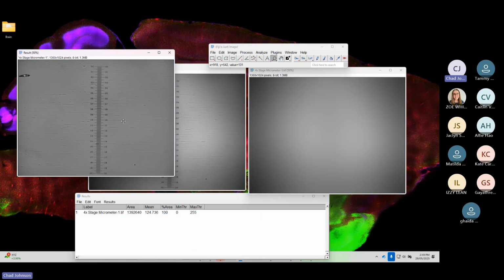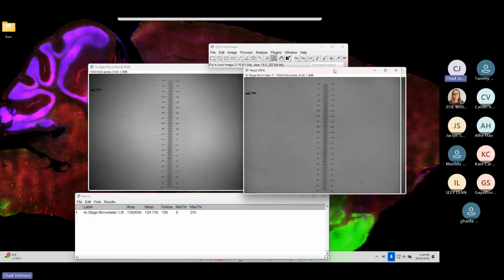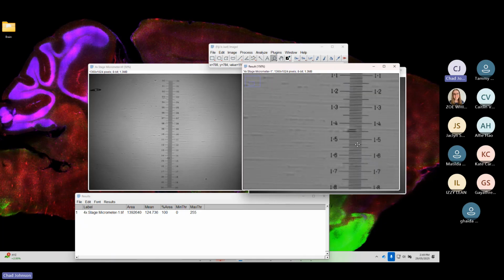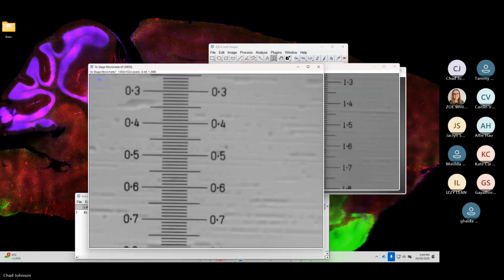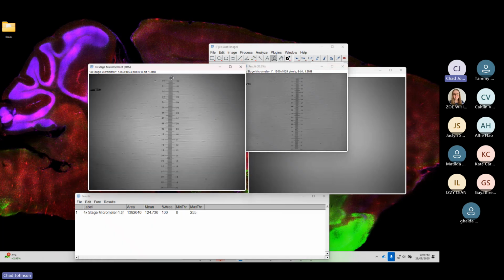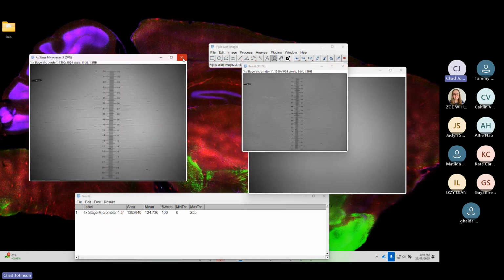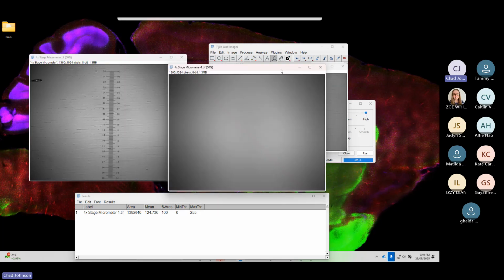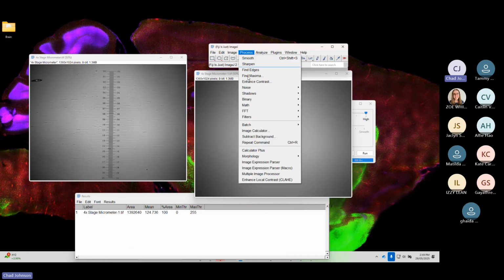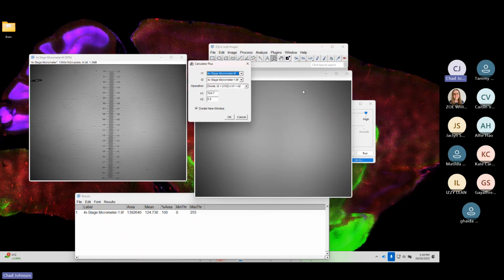And you can see the vignetting has now disappeared compared with one to the other. The basic data is still very much there, but we've removed that vignetting, and you can use that for pretty much at any point. Now, if of course you had actually collected a background image at the microscope, you wouldn't have to create one. You just use that, and then you do the same thing with the image calculator plus: you would measure the mean intensity of the background image and plug it in there, and image 2 would be your background image.